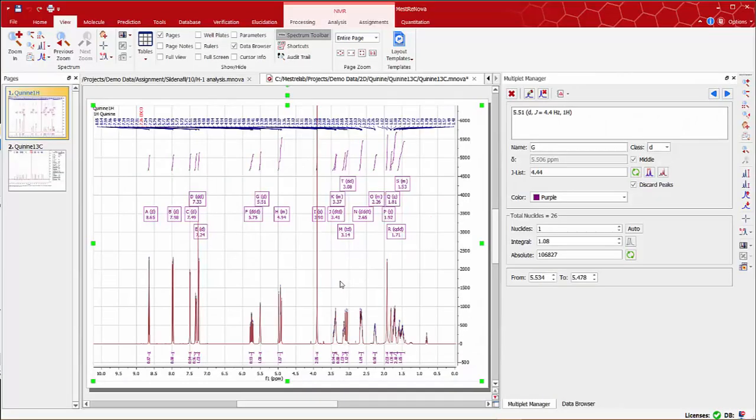Welcome and thanks for joining me. We're going to show you how to process, analyze, and report a 2D HSQC spectrum.